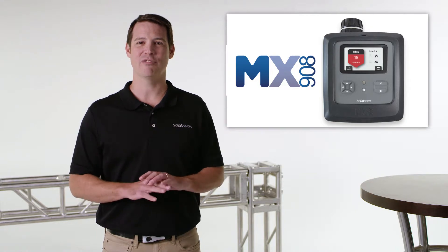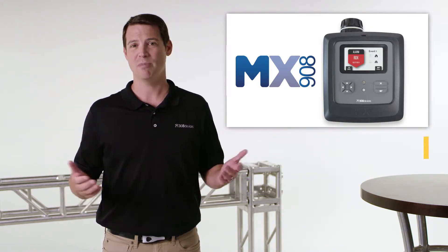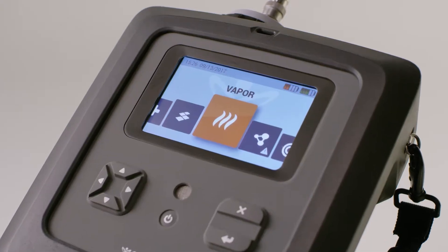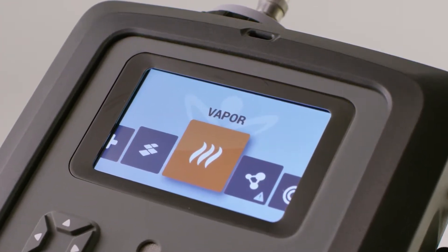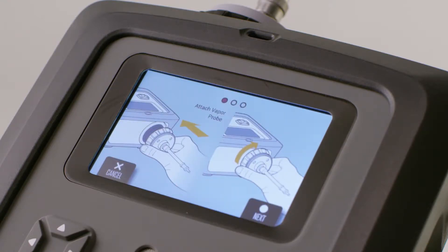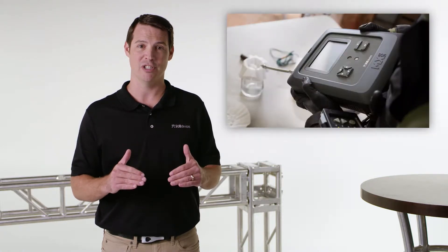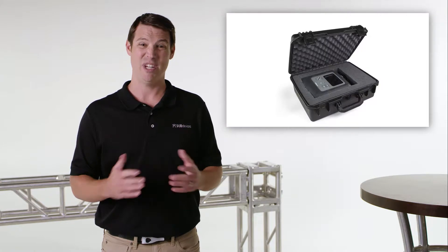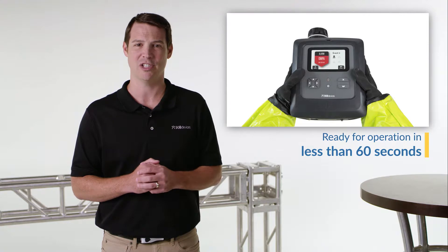MX908 is designed for simple operation and minimal maintenance — so simple that on-site operator training is typically conducted in less than four hours. Its clear and obvious user interface even includes a walk-through mode that refreshes trained users who may not have handled the instrument in a while. It's rugged, designed for downrange operations and built to military ruggedness standards. It's uniquely shelf ready — even from a cold start, it's ready for operation in less than 60 seconds.